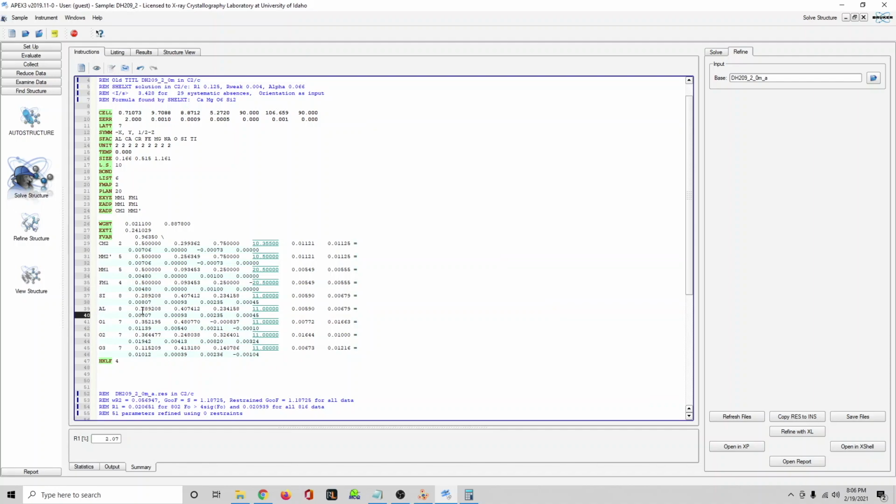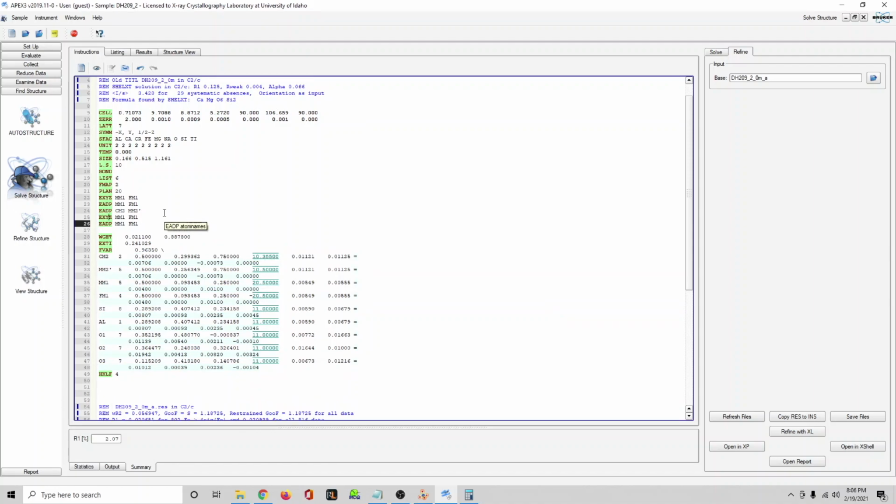Aluminum, and that is number 1 on here, and we need both of those for aluminum and silicon. So let's just say SiAl. And the only reason I didn't refine that as ratios in the first refinement is because the electron density difference between silicon and aluminum is 1, which is so small that it doesn't even matter how you model it. They're just too similar to actually model and refine to give any difference. But here, since we know the values, we can just enter them.